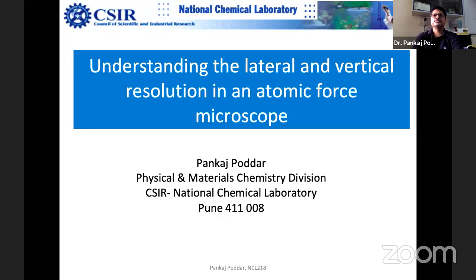So today these two questions we'll look at in detail, and finally we will reach some conclusion on why ultra high vacuum is better for frequency modulation AFMs, which are gaining more and more popularity.